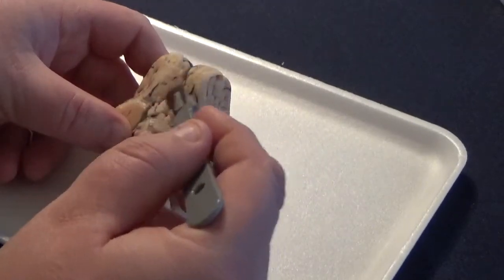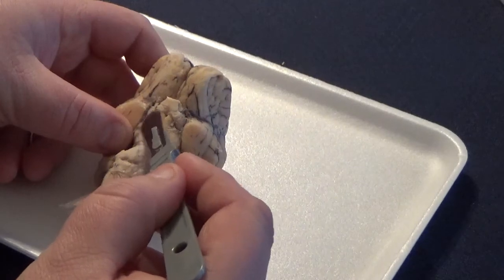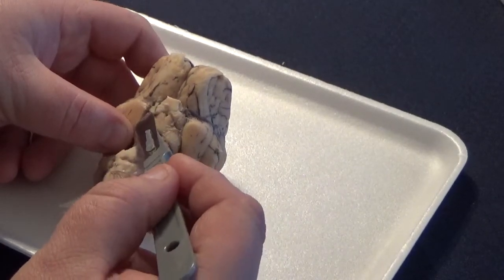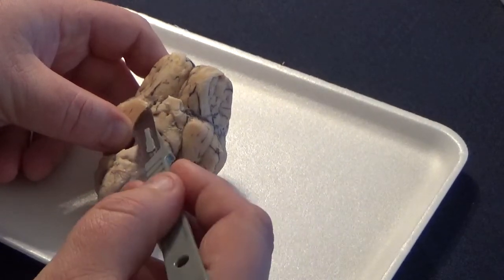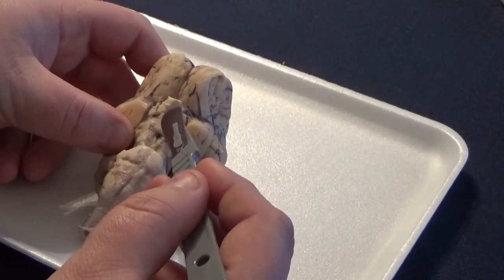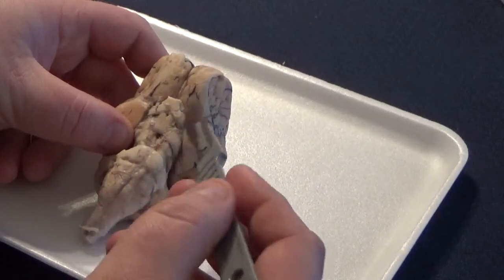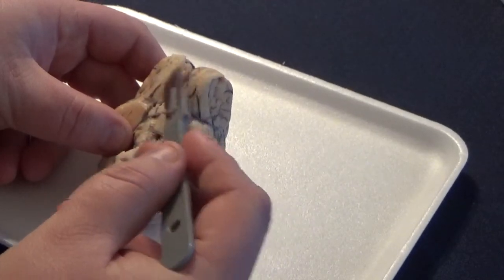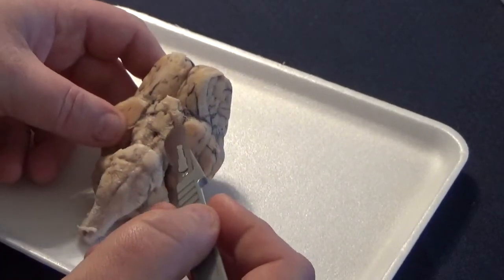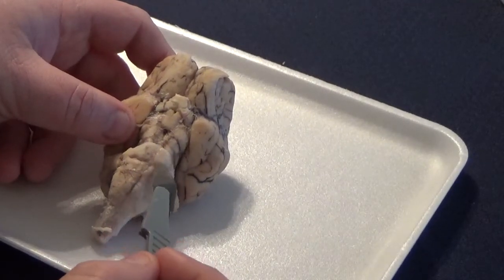Beneath the olfactory bulbs is this white area here. These are the optic nerves. It makes it kind of like a triangle. At the left and right points of the triangle are optic nerves, and the center is called the optic chiasm. So we have optic nerves and optic chiasm. As you can see, the sheep's smelling part of the brain is much larger than their sight part of their brain.